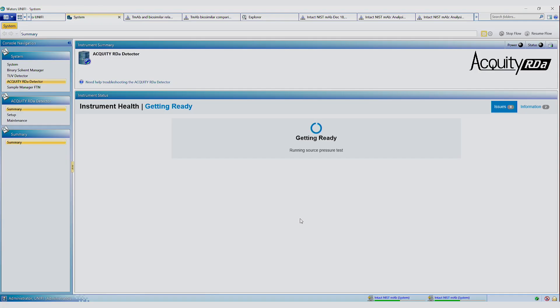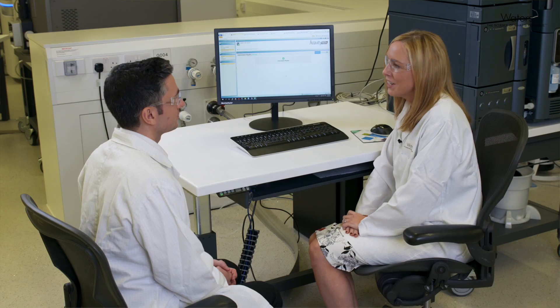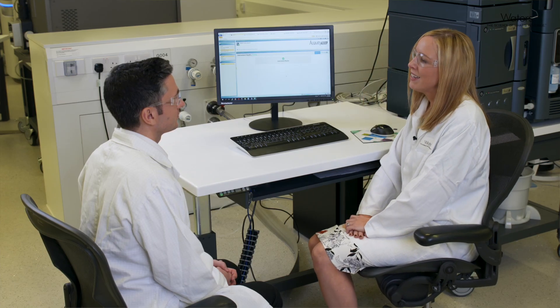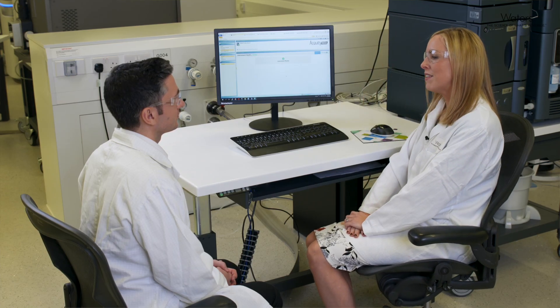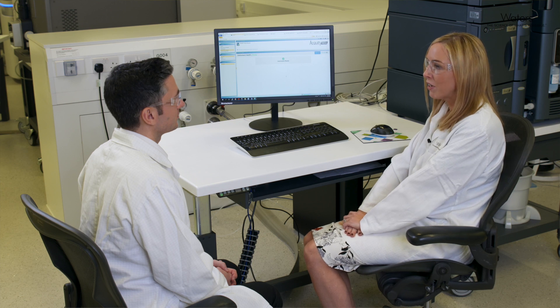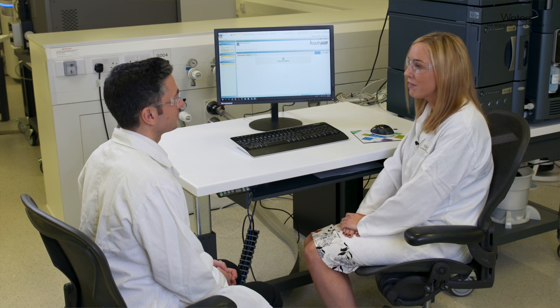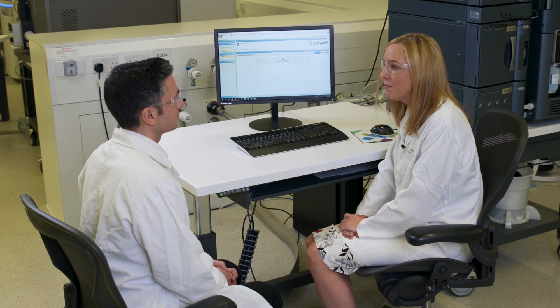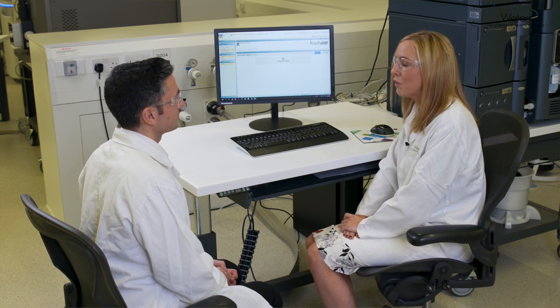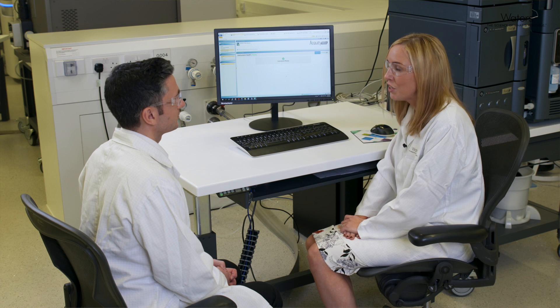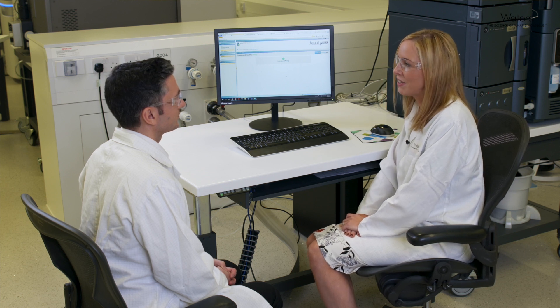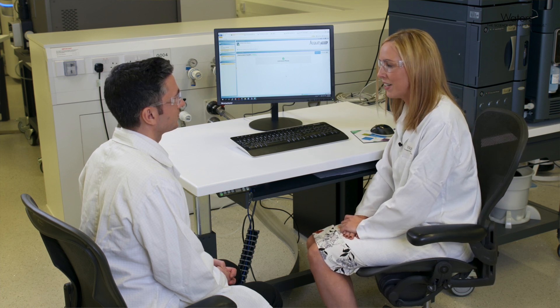And now you've fixed the fault and I'm ready to acquire data again. Thank you for visiting the Waters Demo Lab today. I've demonstrated that the Waters BioAccord Smart MS enabled LC-MS system is a robust and easy to use platform for biopharmaceutical analysis and monitoring.